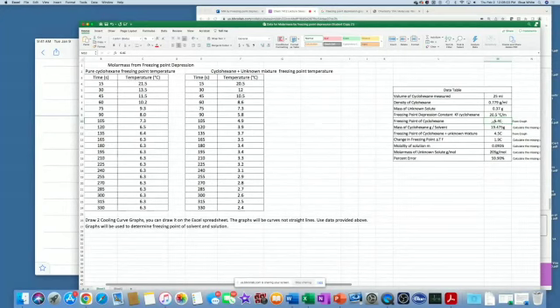You can double check this one here. I'm going to highlight what you should double check when you do it yourself. This should be fine. Double check this. And since these influence each other, recalculate this, recalculate that. Essentially, all of the things I've highlighted, you want to recheck, because those will adjust when you get your readings correct.